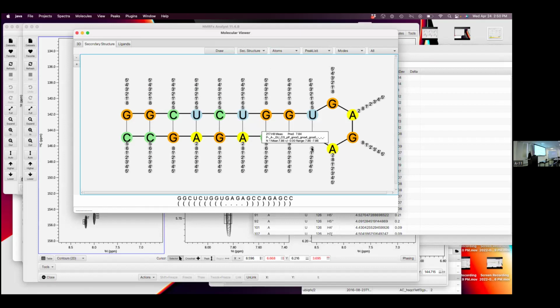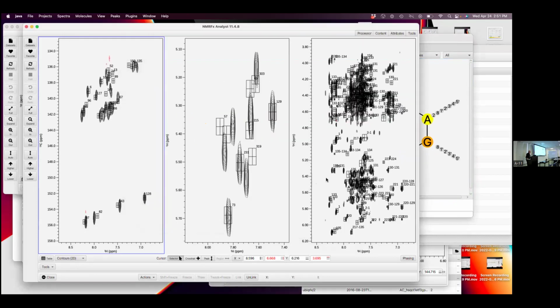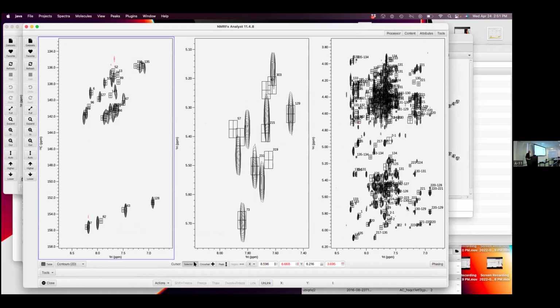We're actually working with, somebody may know Sarah Keene at the University of Michigan. She's had a student project where we're sending them lists of RNA sequences where there aren't deposited shifts. Her students make little fragments with those, and then that data comes back into our database. So we can predict shifts, and then these spectra here are proton, NOESY, TOCSY, and an HMQC, and we can predict what the spectrum would look like, and that's a leg up in doing the assignment.